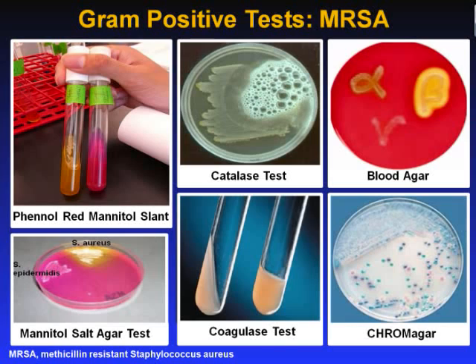Catalase is a common enzyme found in some organisms which functions to catalyze the decomposition of hydrogen peroxide to water and oxygen. The test is done by placing a drop of hydrogen peroxide on a microscope slide. Using an applicator stick, a scientist touches the colony and then smears a sample onto the hydrogen peroxide drop. If bubbles or froth forms, the organism is said to be catalase positive.